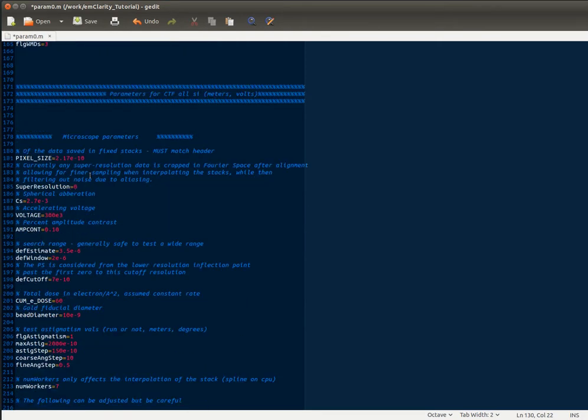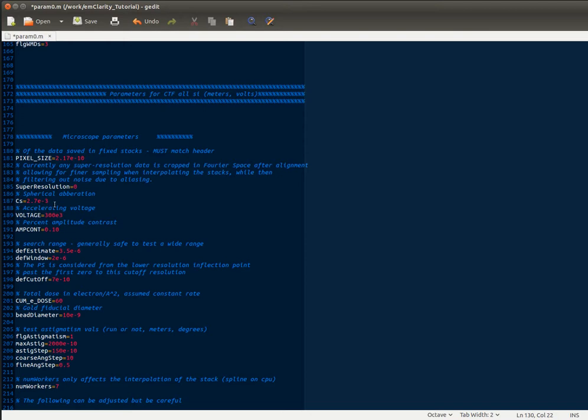And then your microscope parameters are something you'll need to set up. So for this particular tutorial data set, the pixel size is 2.17 angstroms, and everything here is specified in SI units, so that e to the negative 10 just gives you angstroms. It's not a super resolution data set. If you turn this flag to one, it will assume that you've done the tilt series alignment at super resolution, but everything after that will go back to the raw data and it will Fourier crop it to the physical Nyquist frequency to help remove any aliasing from noise. The spherical aberration for this particular microscope is 2.7 millimeters. That's going to be true for a lot of you doing your experiments. The voltage is 300 kilovolts. In amplitude contrast, you can choose a value between generally 0.07 and 0.14. 0.1 seems to work well for a lot of things.